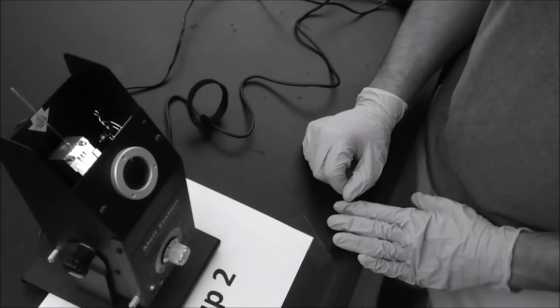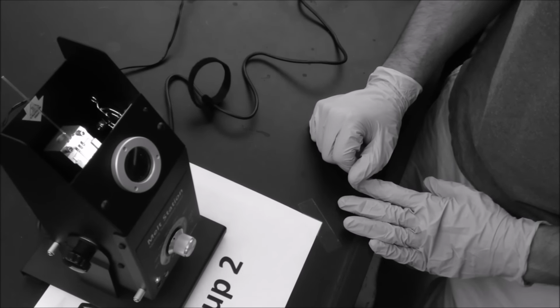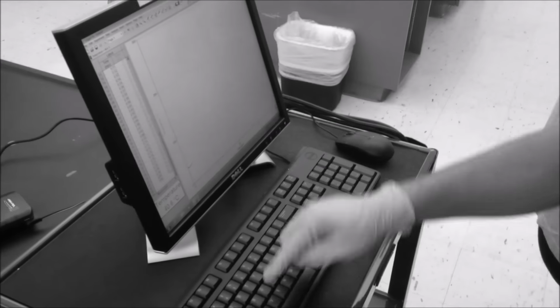On the melting station, turn the knob to a setting of 180 degrees Celsius. Carefully observe your sample. If the solid begins to melt, click mark to mark the temperature on your graph, or press D on the computer. When the entire solid has completely melted, click mark again. Those 2 values marked on your graph describe the estimated melting temperature range of your substance.